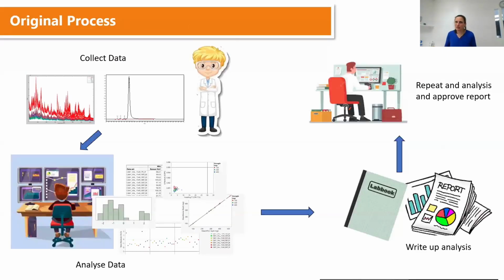So the traditional process has been this. Each year when this validation comes around, we've had somebody in the lab who's gone and collected the spectra for the 60 capsules. And because it's a non-destructive test, has then gone on to collect the HPLC results for the same capsules. That data has then been checked and approved, and it's been passed to me in the office.